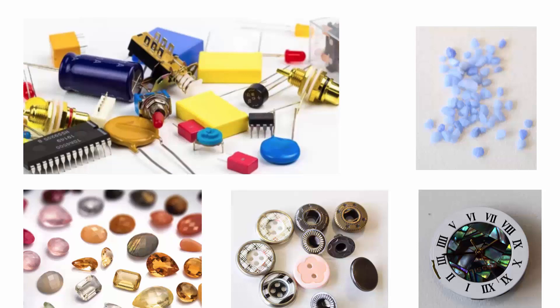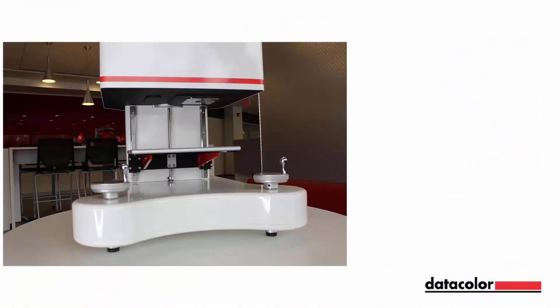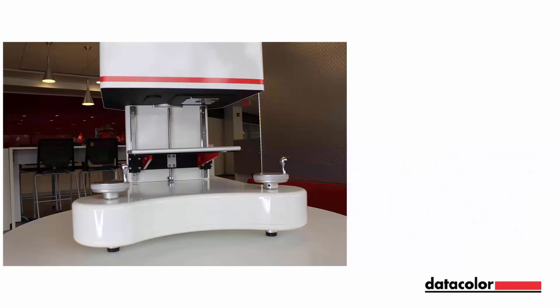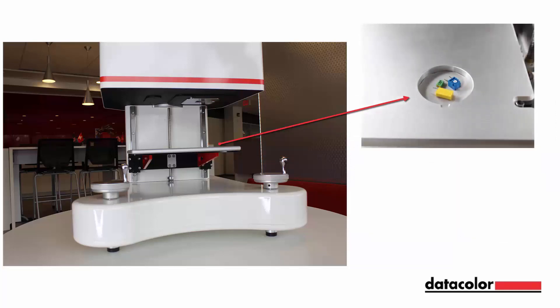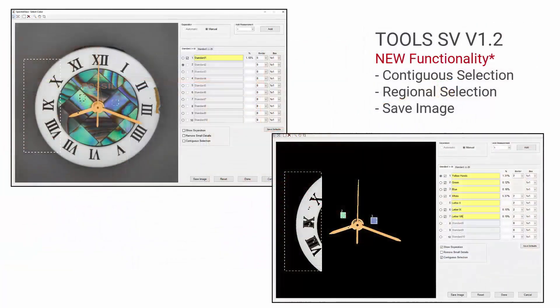The video will show how the measurement can be accomplished and the color metric data acquired for these challenging and unique materials. The vertical configuration eliminates the risk of materials falling into the sphere through the aperture plate, as well as eliminates the need for a mounted sample holder that sometimes causes light escaping issues. We will cover steps on how to correctly position the samples, adjust the instrument using the coarse and fine dials, review of the sample trays, as well as using new color separation methods like the contiguous and regional selection.